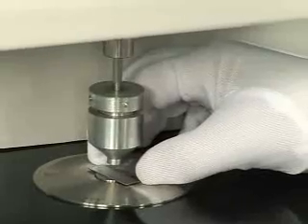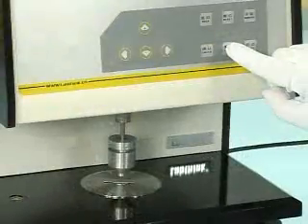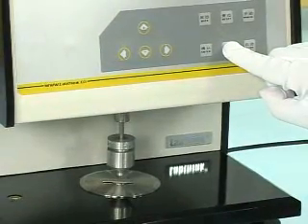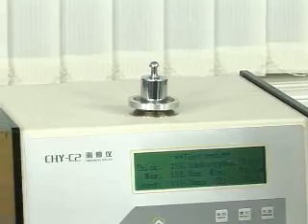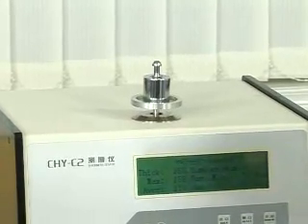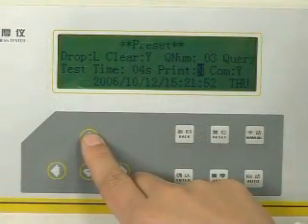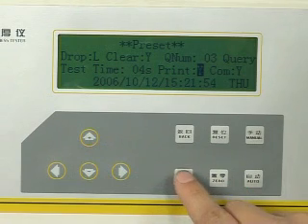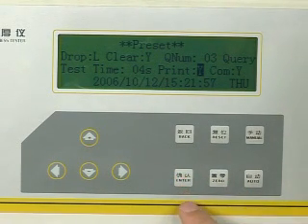Special configuration design guarantees the parallel of the upper and lower test surfaces. Flexible and convenient counterweight method can satisfy a wider test range. LCD displays test parameters with a friendly operation button.